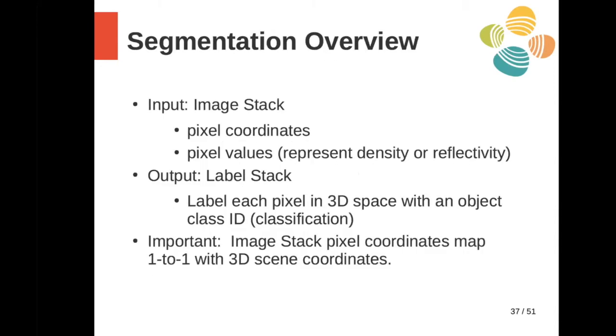Okay, so that took care of our introduction to the image stack and a variety of aspects about it: its qualities, attributes, characteristics, what it is, and some of the pre-processing we need to do to get it into good shape so that we can begin the next part, which is segmentation.